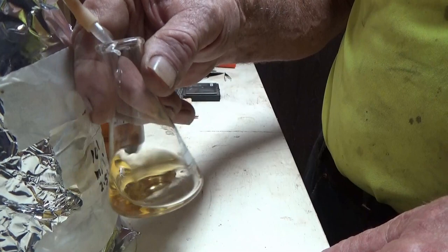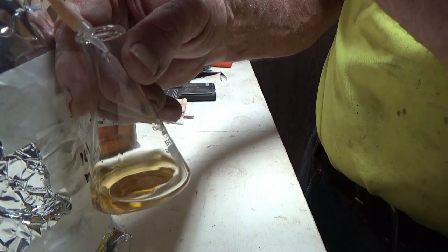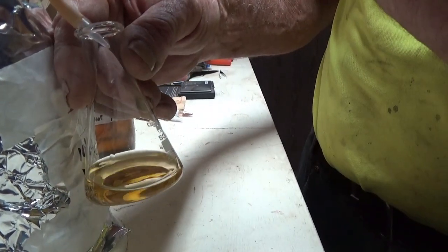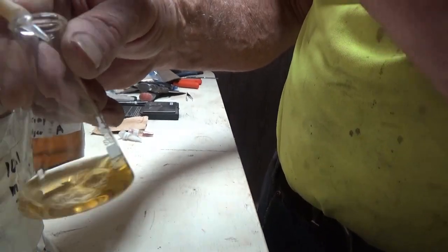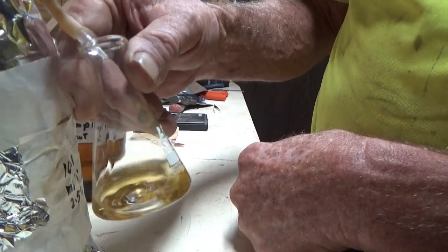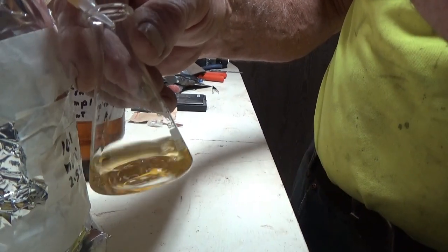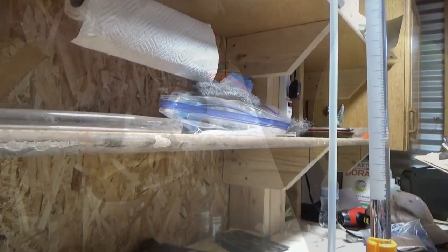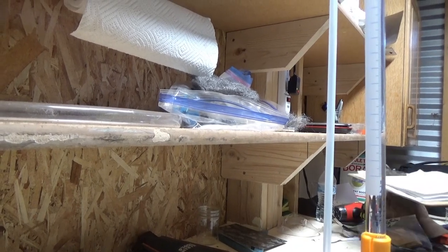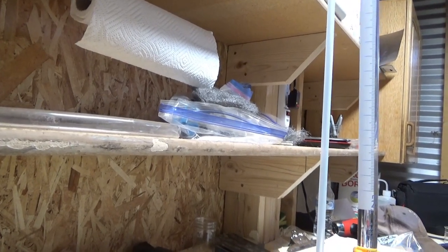It's using a lot more stuff. Speed it up a little. Perhaps my 2 is point whatever. Let me get my instructions here in a minute. I did use 1 gram in 100 mils. Well, guess what? That meant I should have used 2 mils. Okay, go ahead and just watch it.